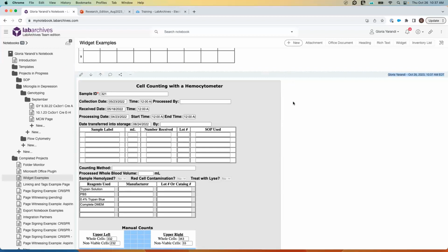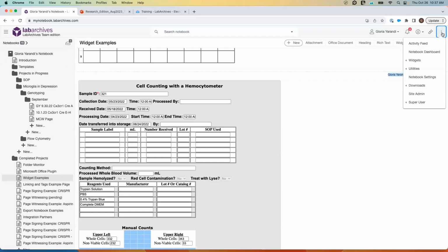So to create a custom widget, you go to our triple dot menu, and under Widget, you'll see our Widget Manager. We'll go over widgets in more detail next week, October 31st. Another opportunity to learn about widgets is our boot camp going on, and on Friday at 1 p.m. Central, we have a session that talks about widgets as well.